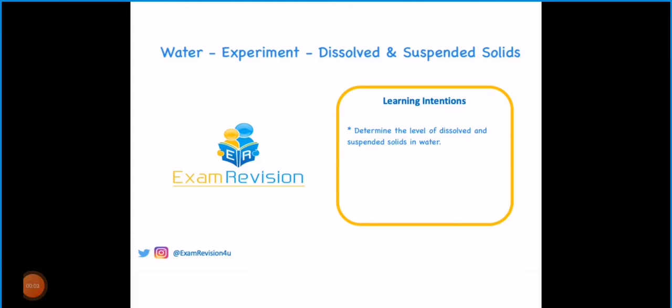Welcome back. So in this video we're going to specifically look at another experiment, and this one is to determine the level of dissolved and suspended solids in water. And I'll go through an exam question in this video also.